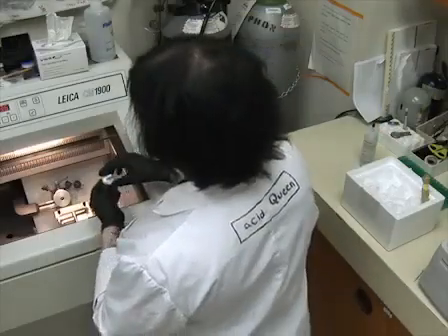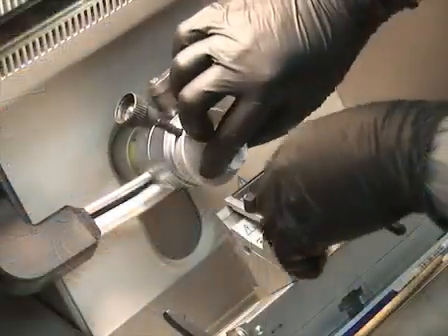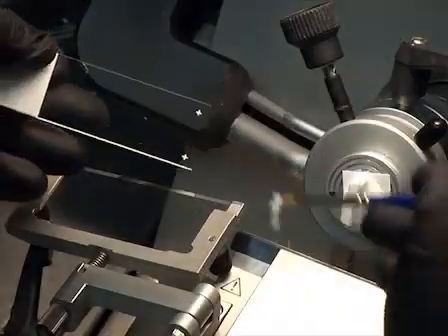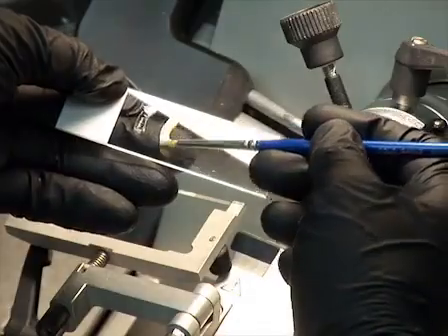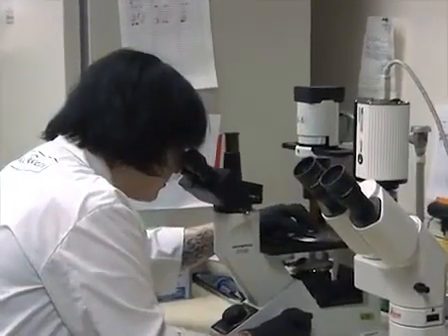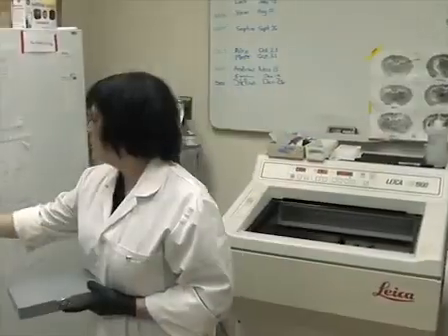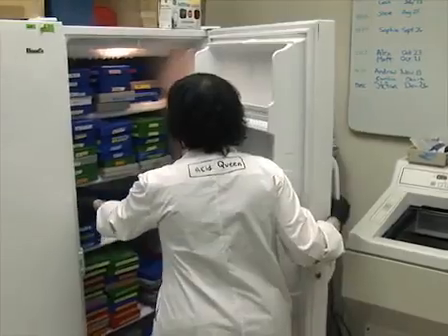Allow the samples to equilibrate for at least 30 minutes. Once this is done, cut quickly to the marks made on the mold. Then start collecting every section from then on, checking to see where the neurosphere slices begin using a light microscope. Once sectioning is complete, store the slides in a freezer until you're ready to perform immunocytochemistry.